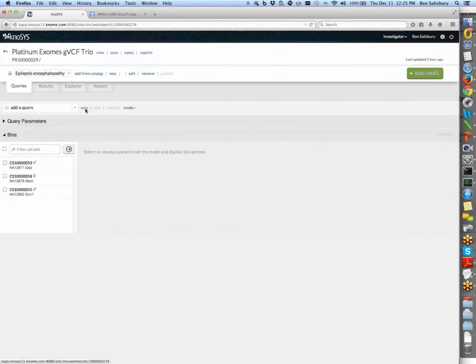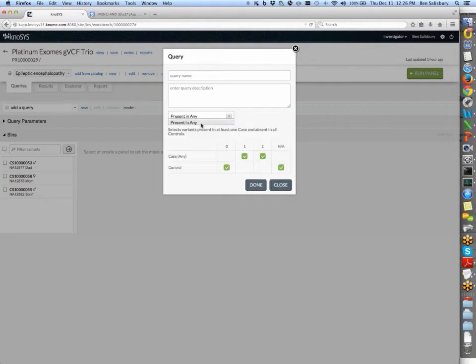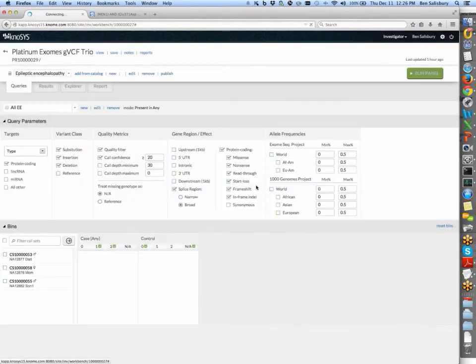And we don't have any queries in this panel, so let's add one. And you have choices here. The first choice you really need to make is what kind of mode you're working in. We could be very specific about whether we're dealing with X-linked genes or autosomal, recessive, dominant, etc. But for now, since we're just getting started with this, I think it might be easier to go with present in any query. So we'll be able to look at all the genes regardless of where they fall within the genome, and then we could break those out later. So let's just look for all of these epileptic encephalopathy genes.